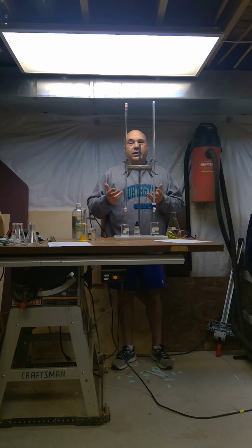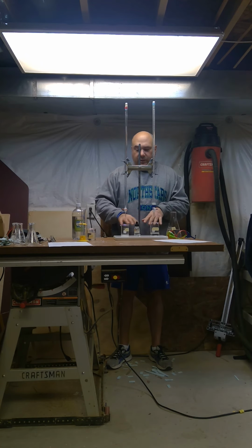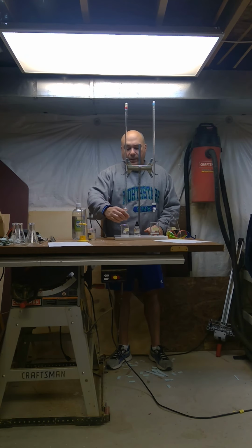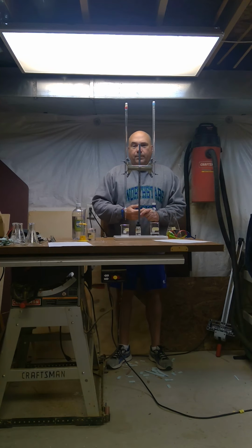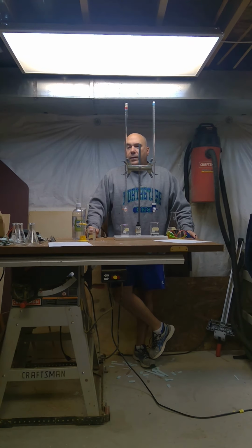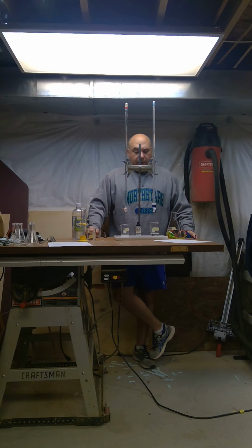I'm not sure how this is going to go. I'm going to bring the computer over near me so you can actually see what's happening down here. Now, the indicator that we're using today is phenolphthalein, PHTH. PHTH changes color between a pH of 8 and 9, but at a pH of 8, it's a very light pink. So you've probably worked with phenolphthalein before. It's all I have, and it's the best that we can do in these circumstances, and it will get us pretty close, as long as we look for that light pink color.